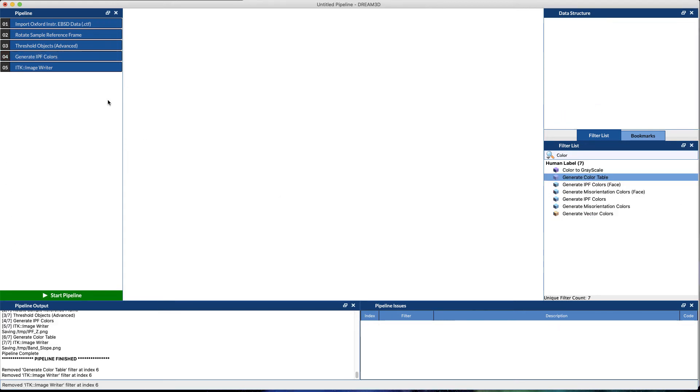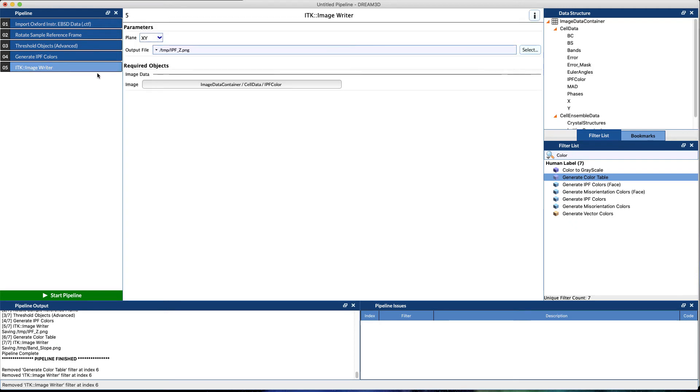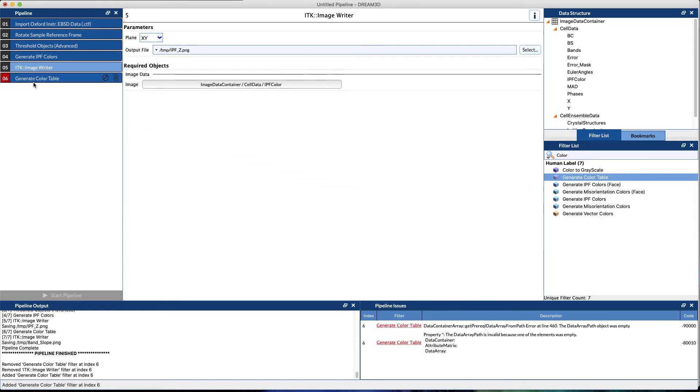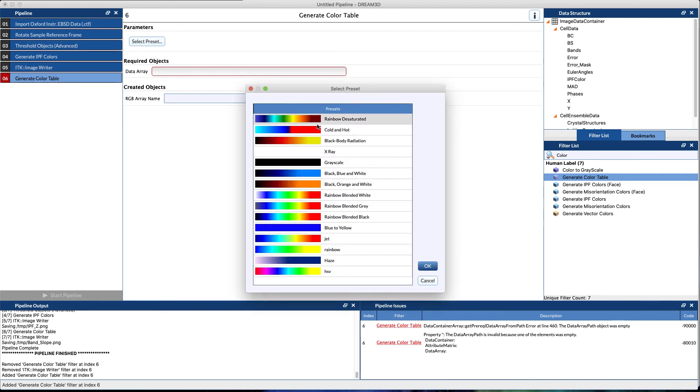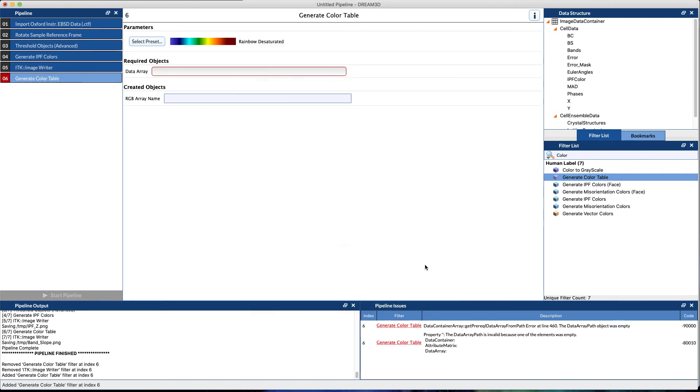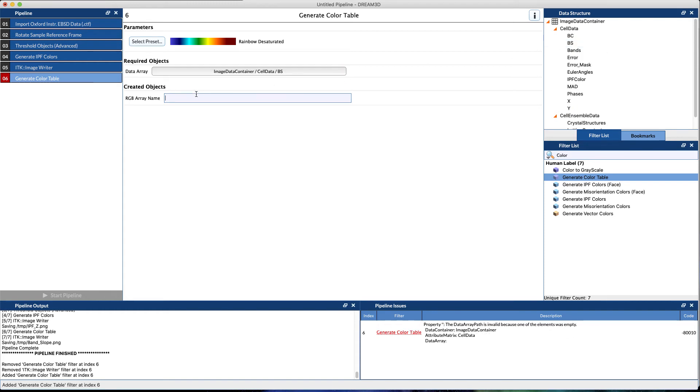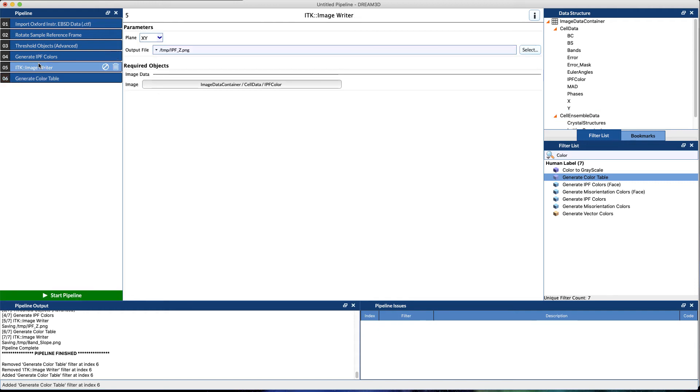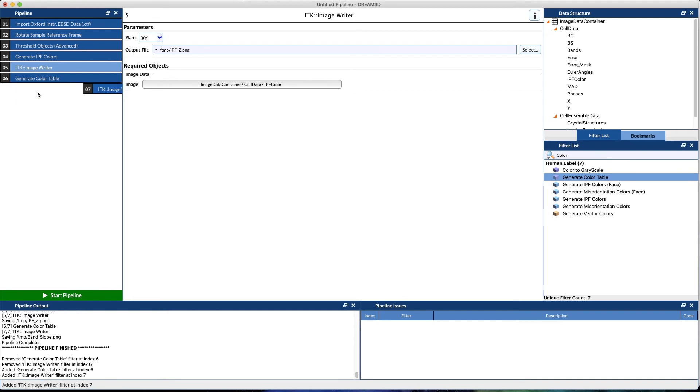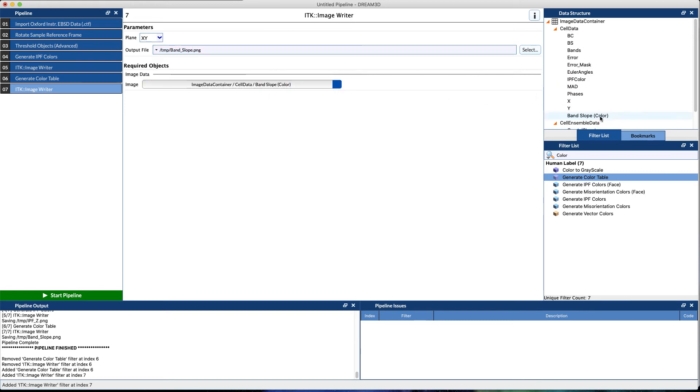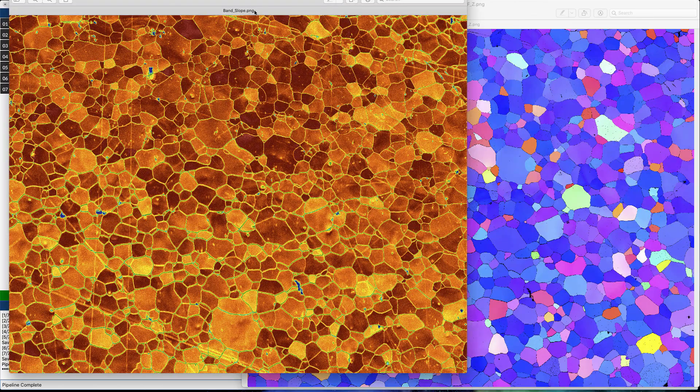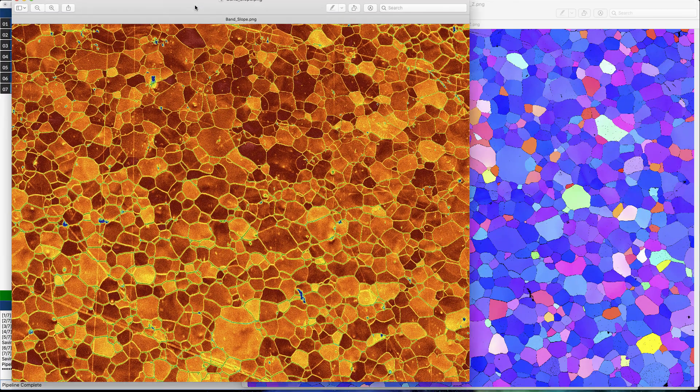Another item that you might want to visualize would be either the band slope or band contrast or any of these others. What you can do in Dream3D is generate a color table for those particular data items. Select a preset that you would like to use, select a data array—we're going to go with band slope—give it an output name, and then we can quickly do an Alt or Option drag to copy the output image writer. Give that an output name and update our inputs, and then run the filter. And this is what our band slope looks like.